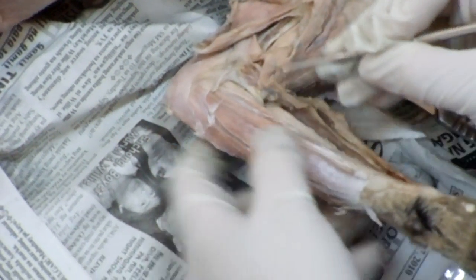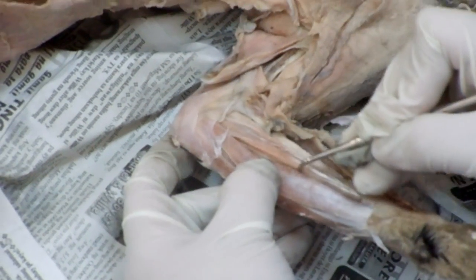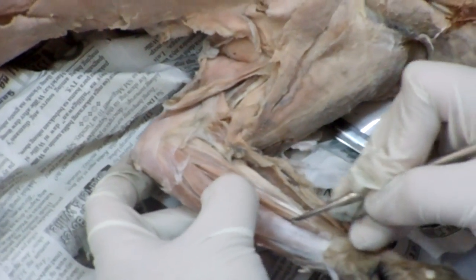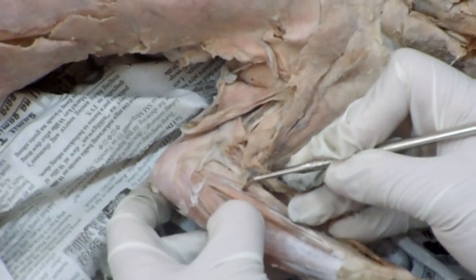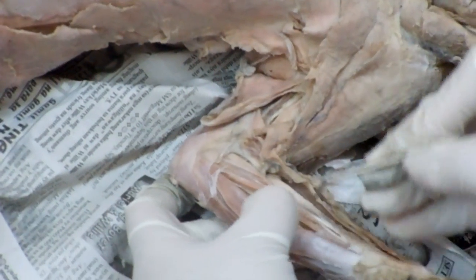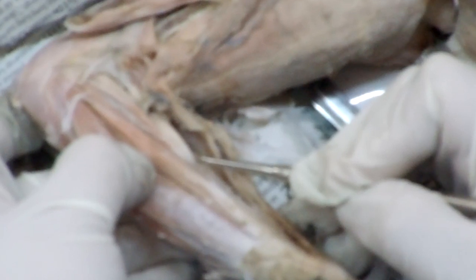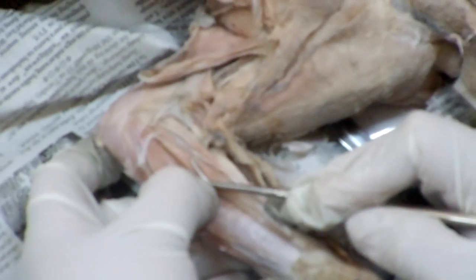Flexor carpi radialis. Lies next to and mostly under the preceding. Origin: medial epicondyle of the humerus. Insertion: second and third metacarpals. So, flexor carpi radialis. Extensor carpi radialis. Pronator teres. Flexor carpi radialis.